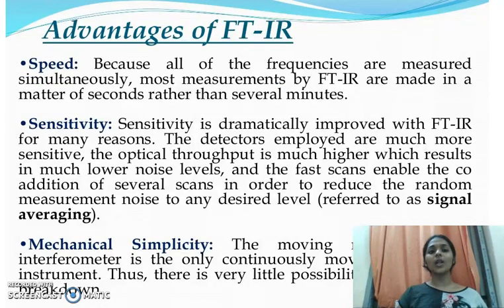Because of all these advantages, FTIR is one of the very useful mechanisms to characterize any sort of materials.